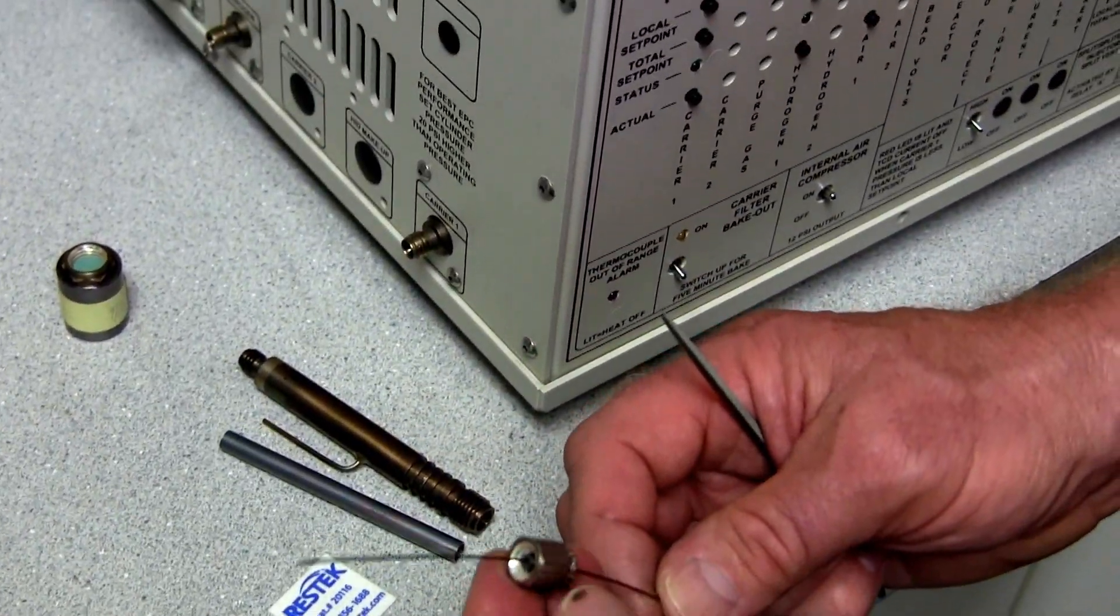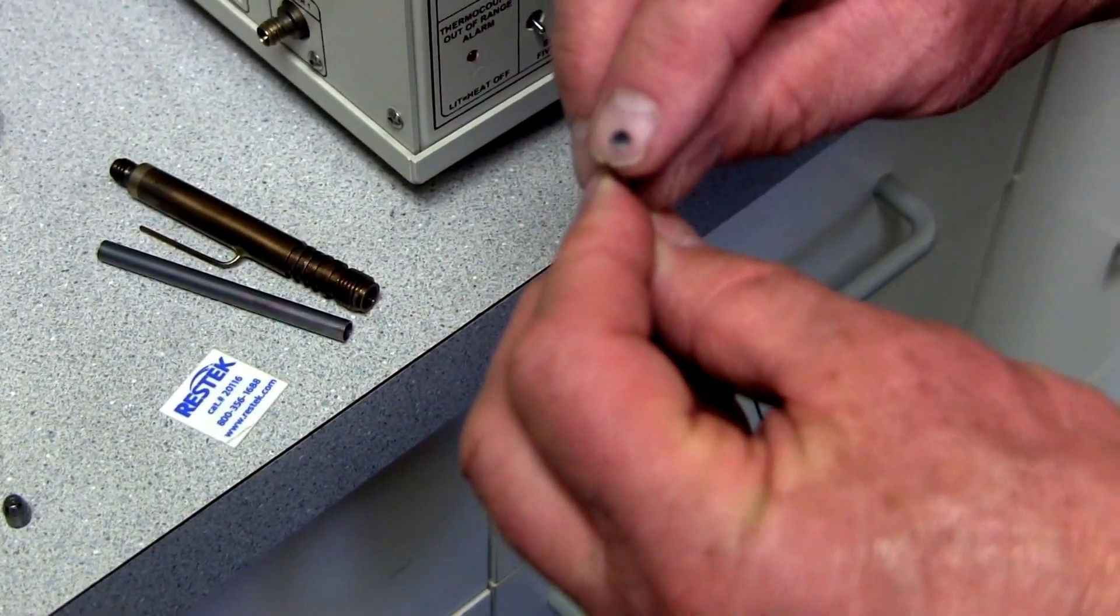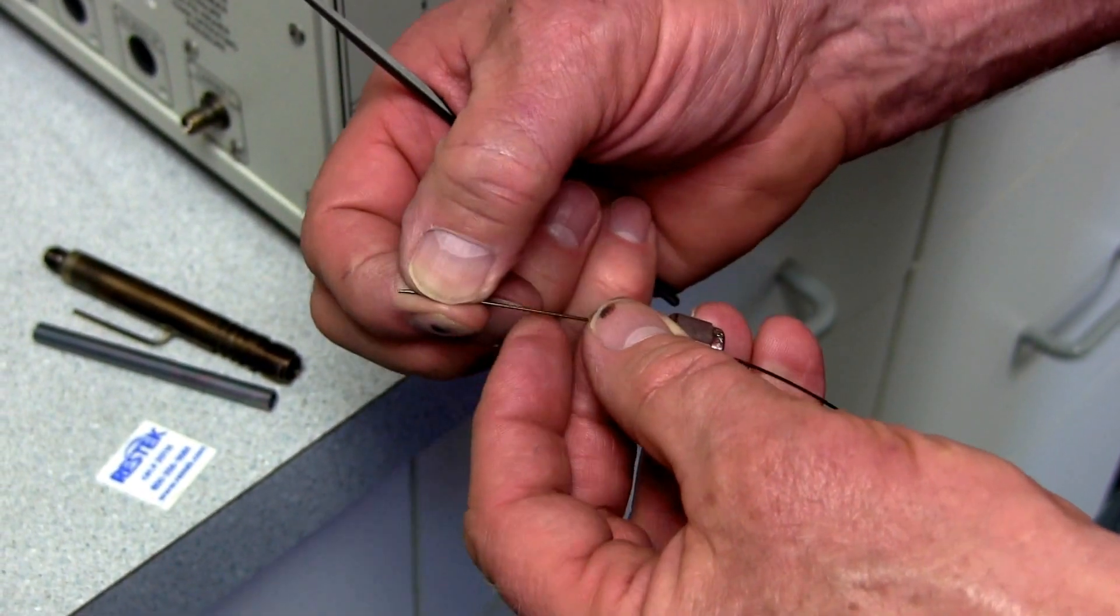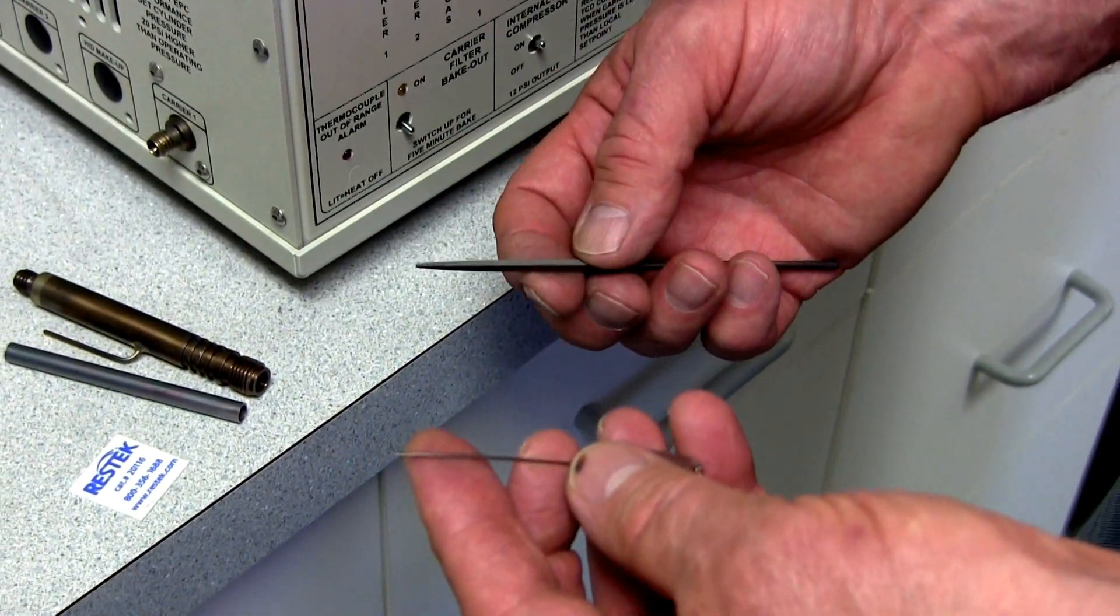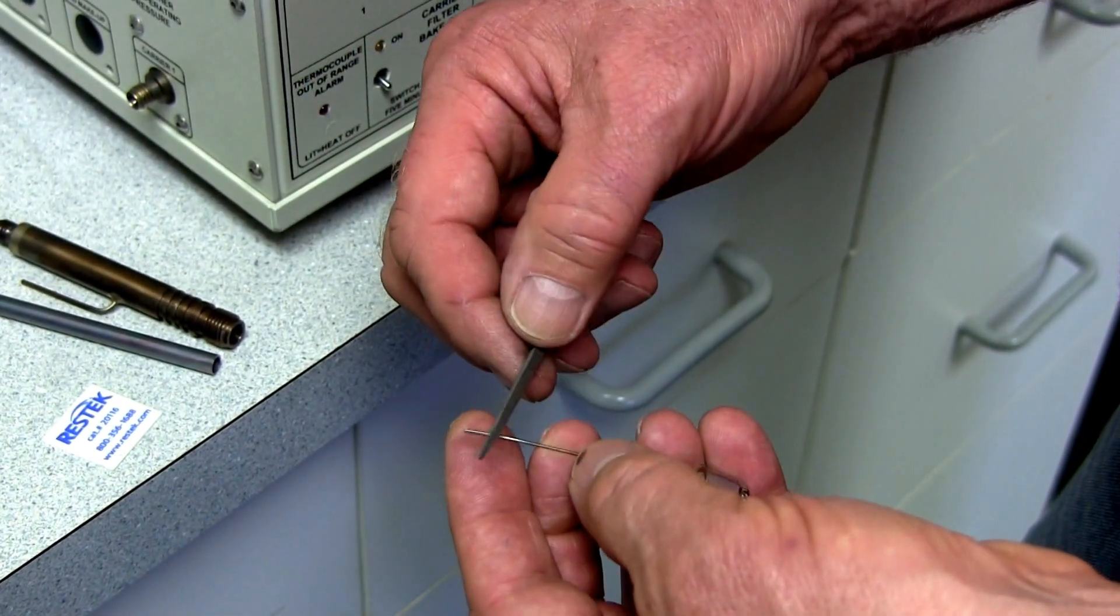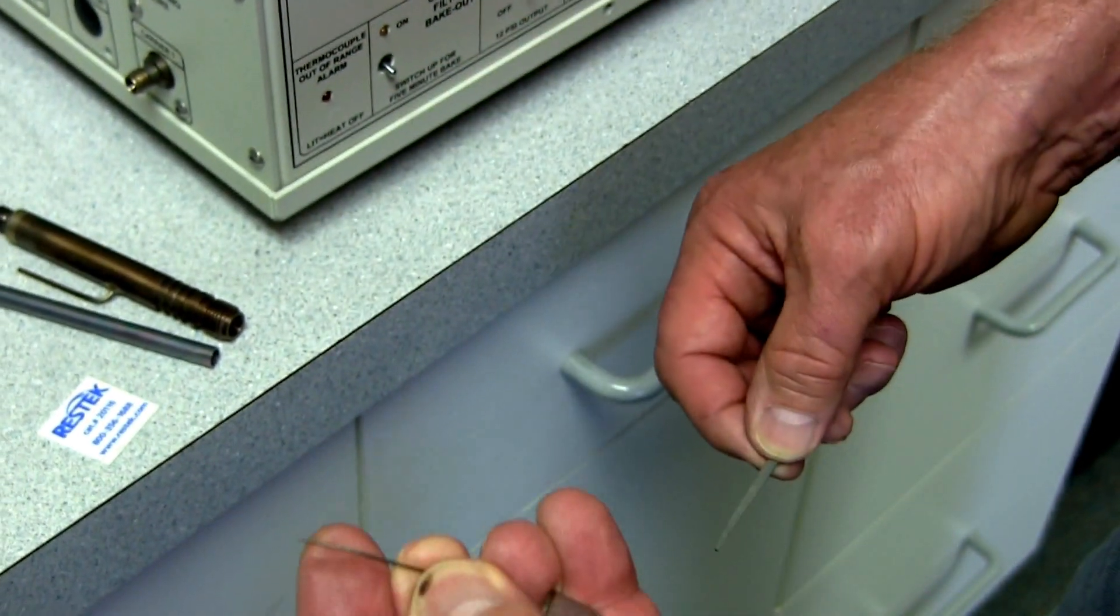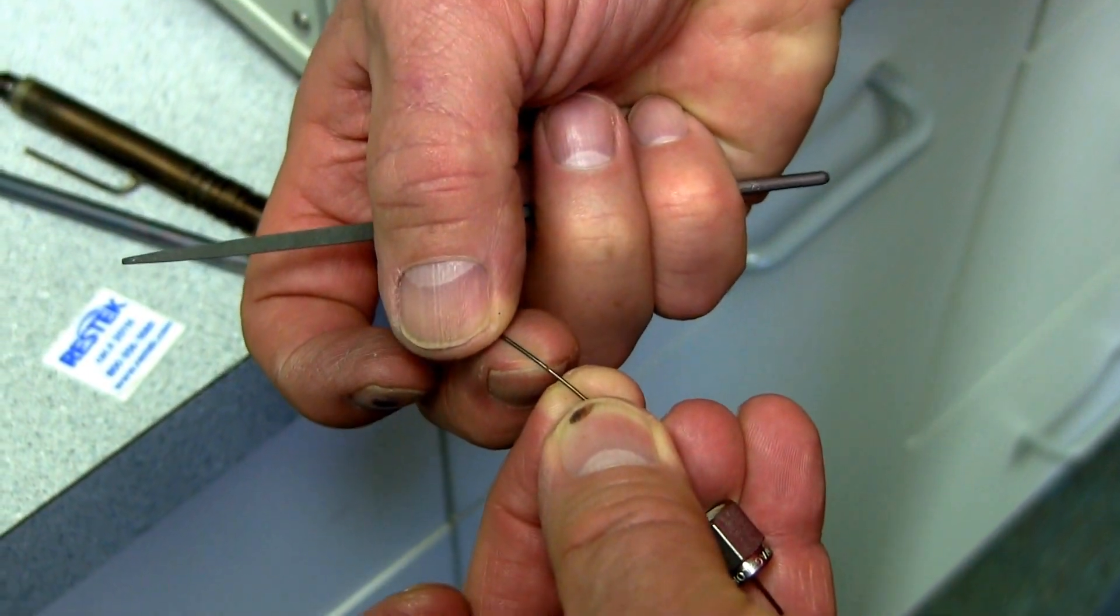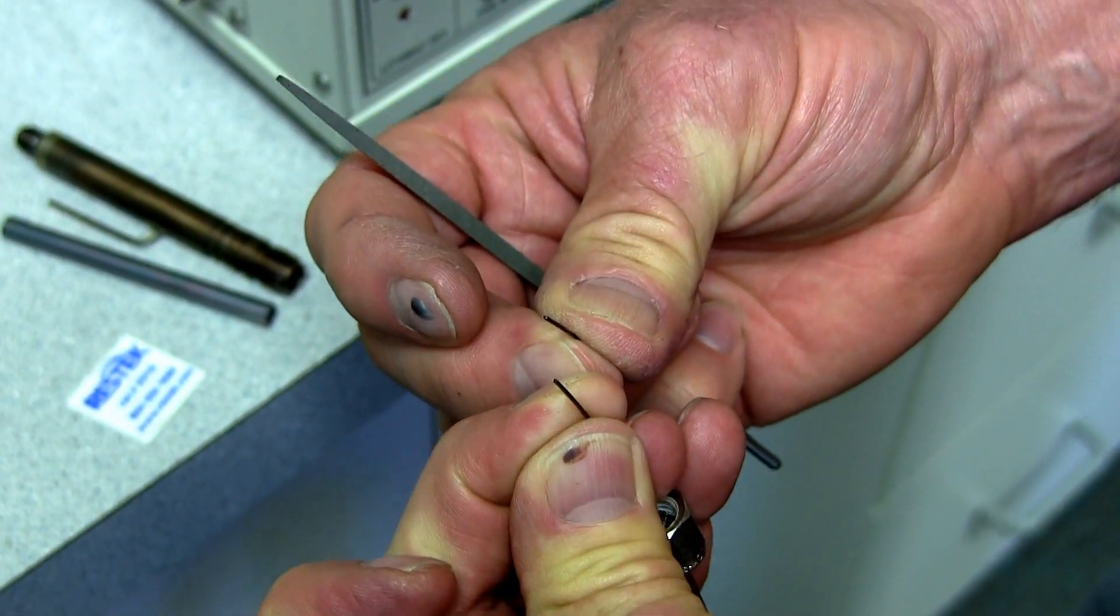You may need also to cut the column because any time you shove the column through a graphite ferrule, it's likely that small little bits of graphite get stuck in the mouth of the column. Sometimes you can see them, sometimes not, but it's not good for the chromatography to have graphite in the column because molecules stick very strongly to graphite. There's several ways to cut the column. The easiest way is to use a little triangle file. You hold the column between your two fingers and you give a nice quick pull that makes a little nick in the column which you can then place directly over your fingernail and the column will break off beautifully clean like that.